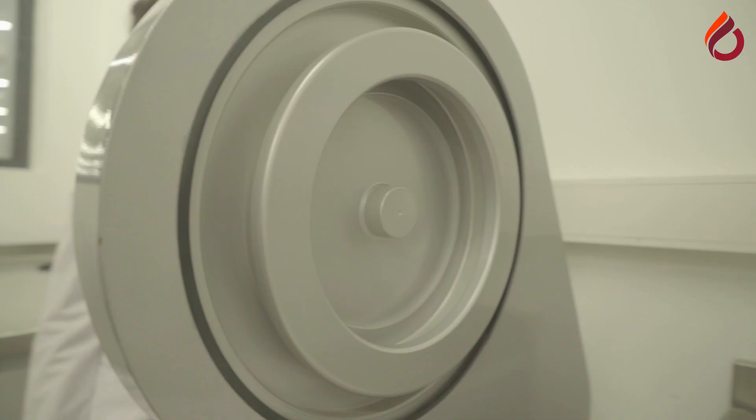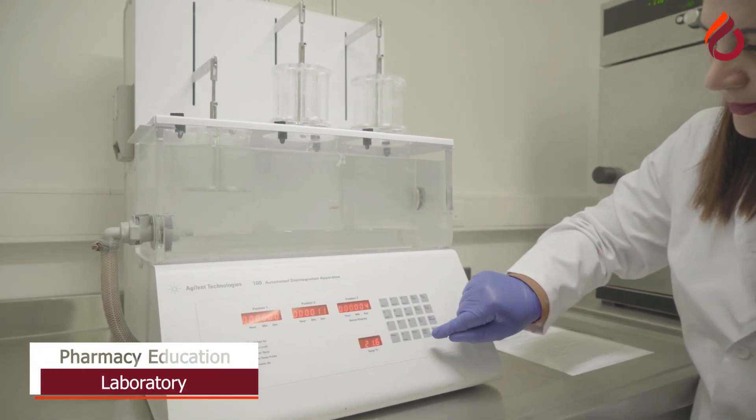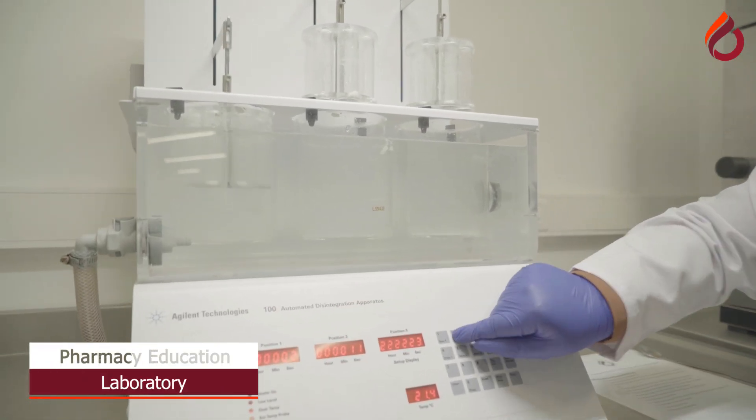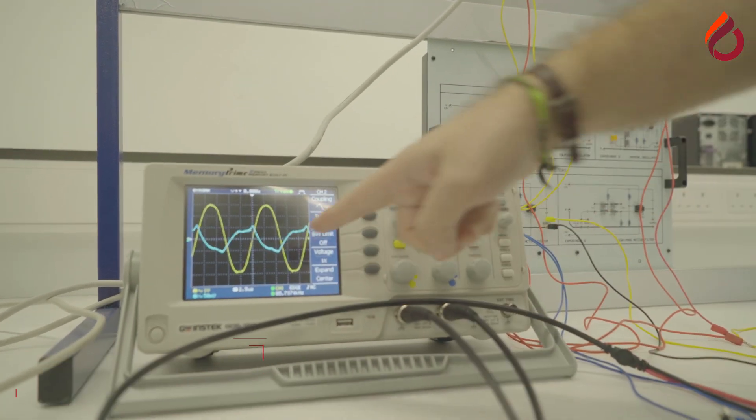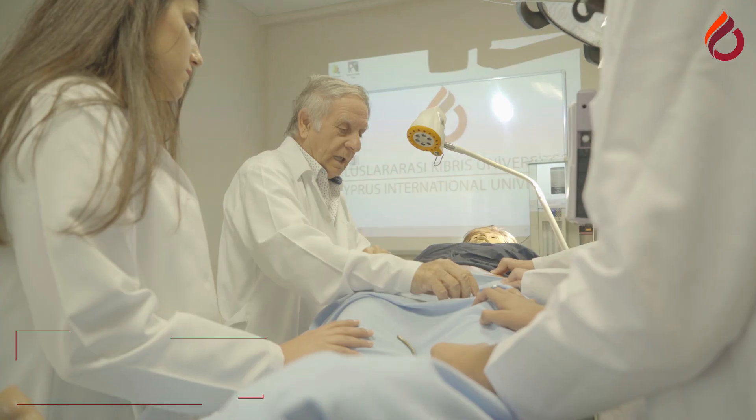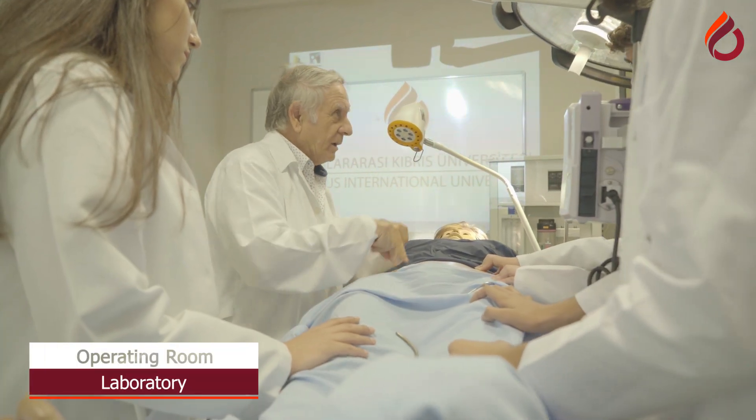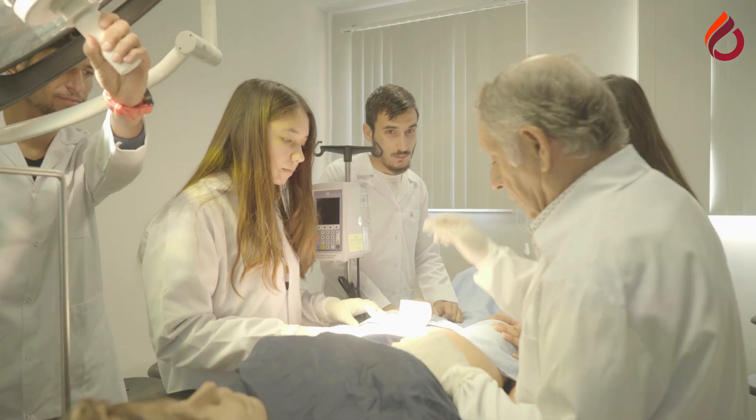The laboratories are constantly developed through continuous investment. CIU offers students the experience to implement scientific knowledge learned in theoretical courses with a research-based approach. Faculty members are also continuously developing their own independent research.